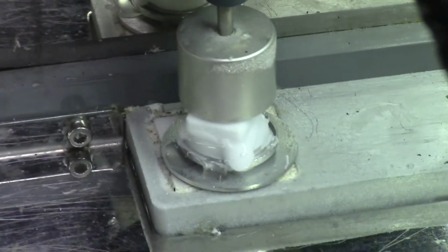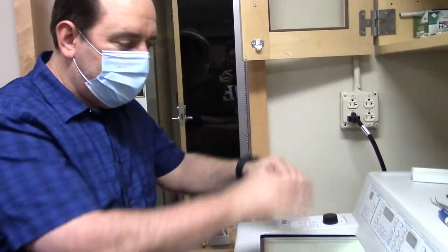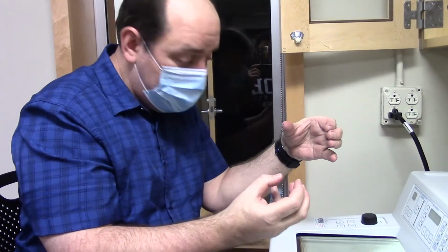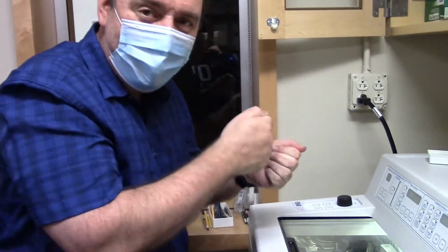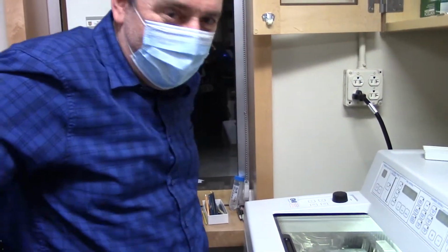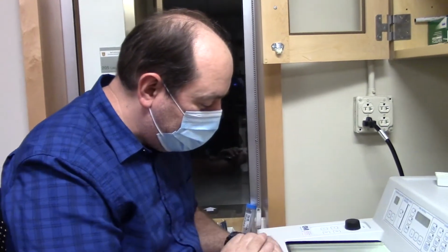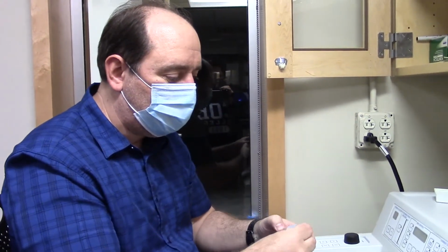and especially because I was holding the metal with my hand, it heated up remarkably quickly. So I want to make sure to freeze that. The one thing that can go wrong at this step is that the OCT leaks off the side of the chuck, and then your chuck is frozen to the Peltier cooler. Yeah, that's not a pleasant experience, trying to pry that up with a screwdriver or something. So it looks like I didn't overdo the OCT, and when that outer layer, that ring that I just put around, is done, we'll be able to go straight to the next step, which is called trimming the block.